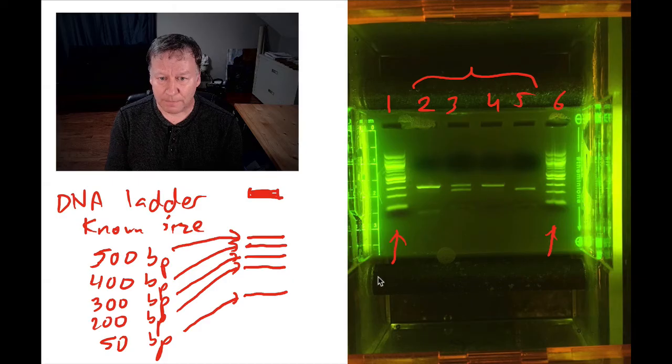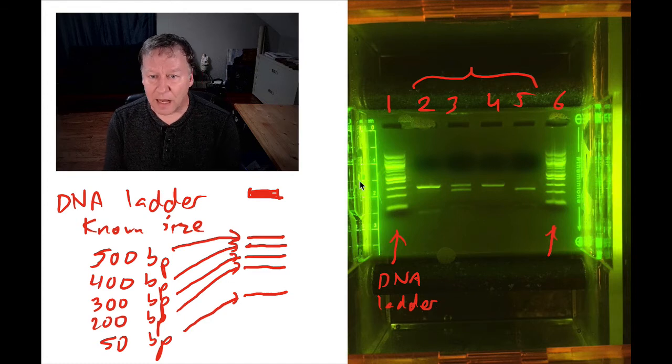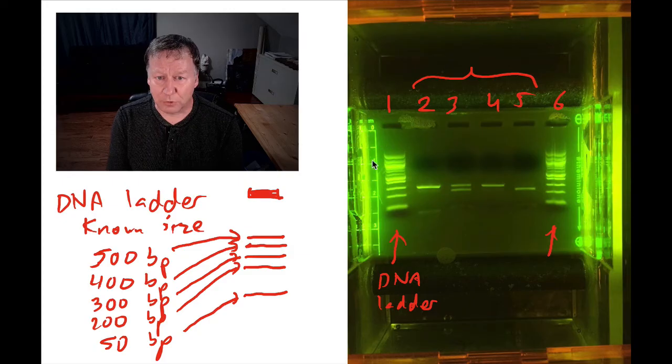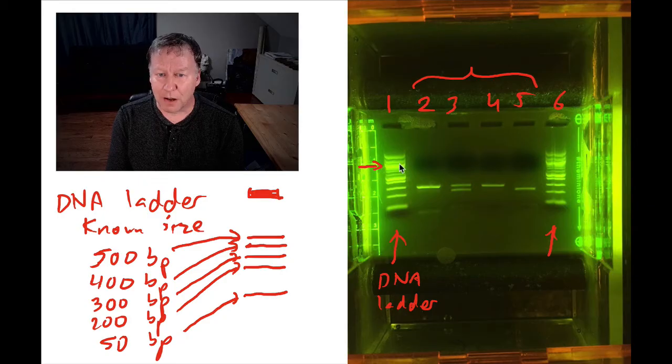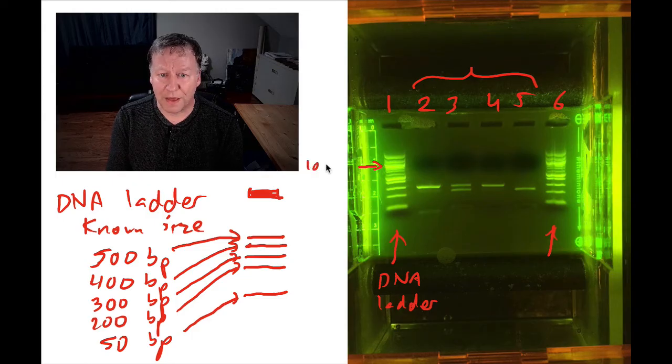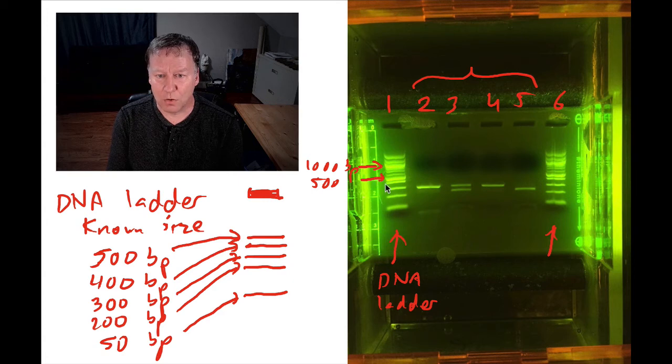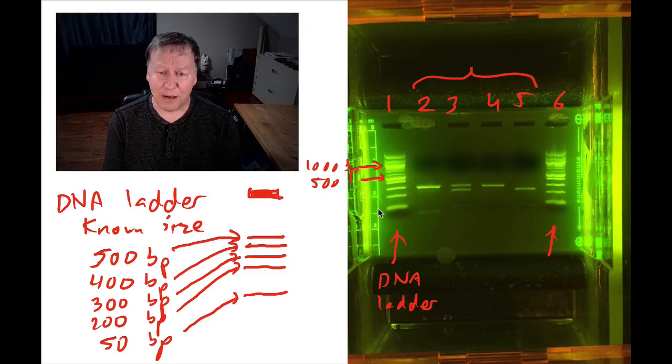In lanes one and lane six, I ran a DNA ladder. This means I have a list of the exact size of each of the pieces you see here. You can see a very bright one right there. The DNA ladder, they tend to include a couple that are very bright to make it easy to identify them. That one right there is 1,000 base pairs in size. The next really bright one is 500. And each one after that is 100 in size, or decreasing 100. So 400, 300, 200, 100.